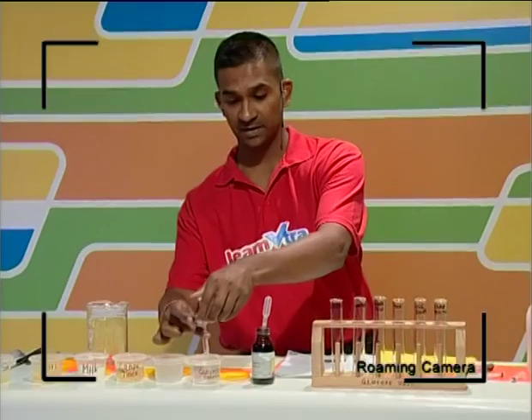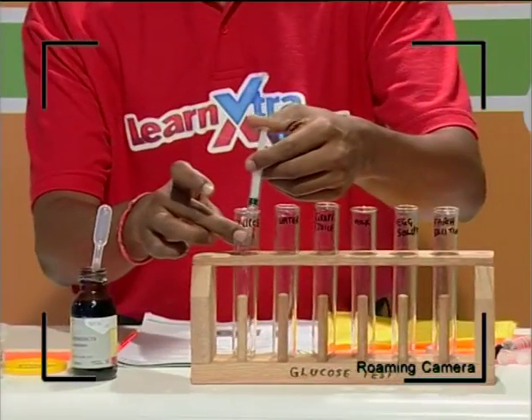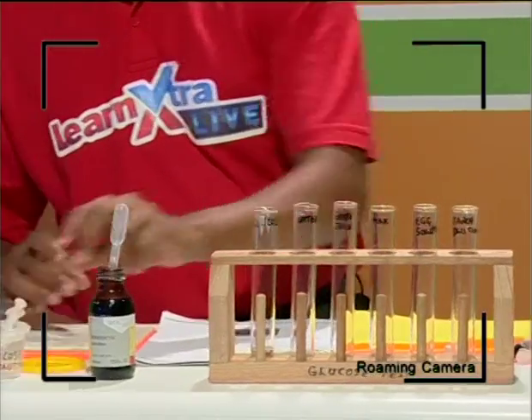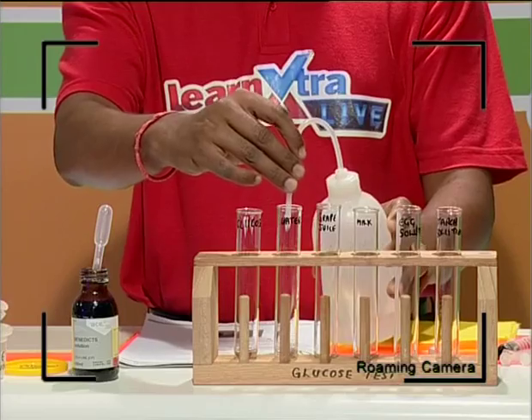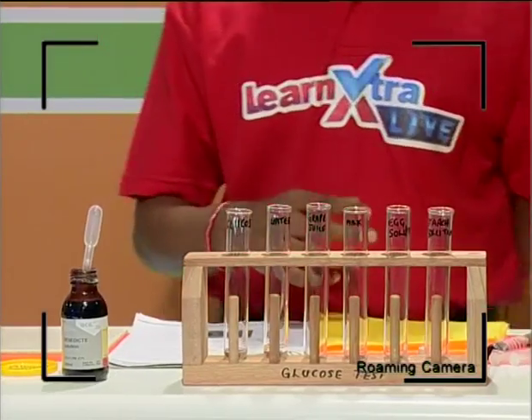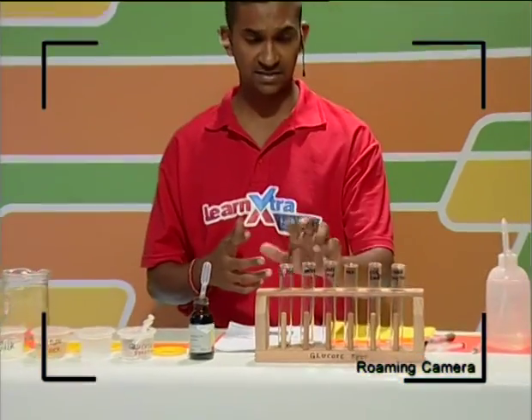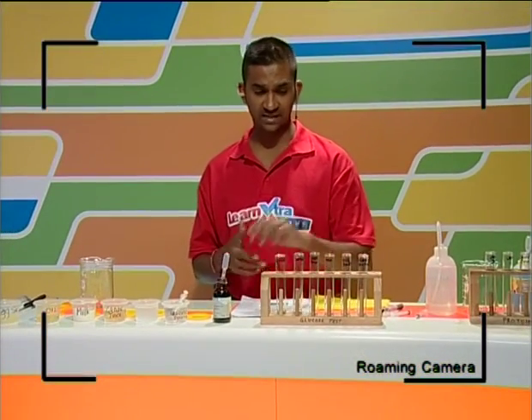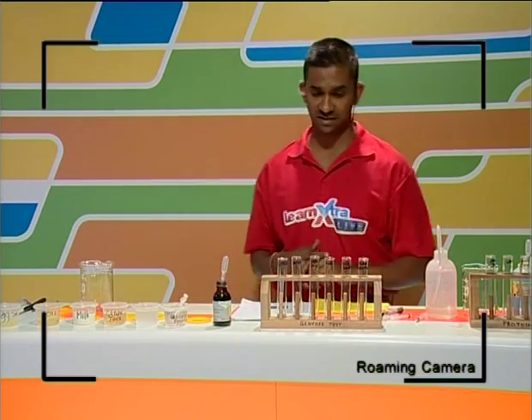So we're going to throw in 2 mLs, guys, into the first test tube, and that is glucose that goes into the first test tube. We're then going to add our negative control, which is water. We're going to add in a similar amount, and we know that water does not have any of the carbohydrates in it. It's an inorganic molecule, and hence this is our positive control and that's our negative control. And so this would be used to compare results against the others.